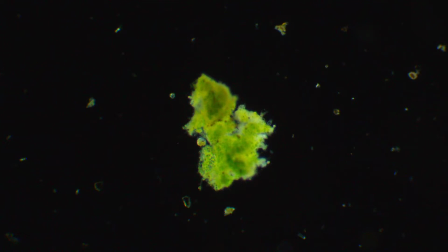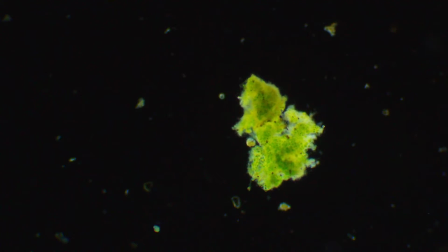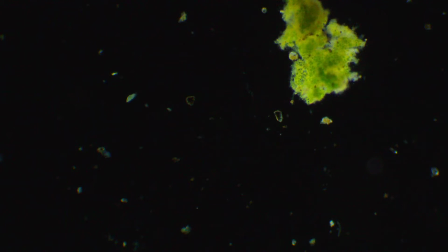You can see him. He's probably hungry. It is dinner time. There he goes. Yeah, he moves weird, but looks like a paramecium to me.